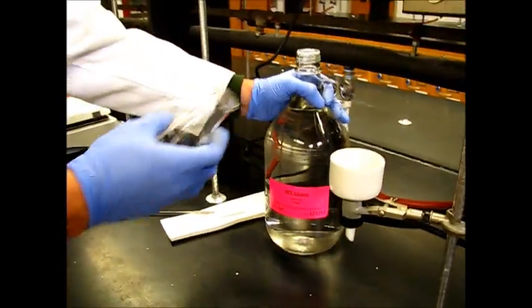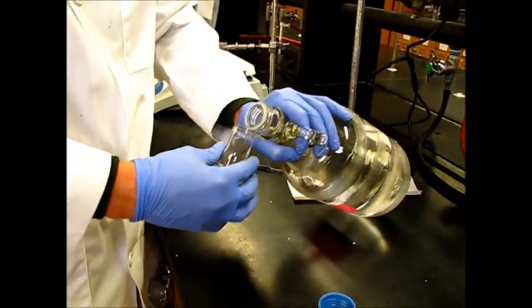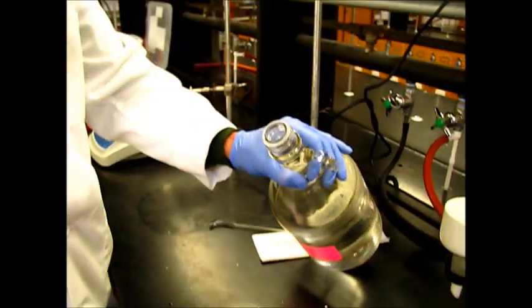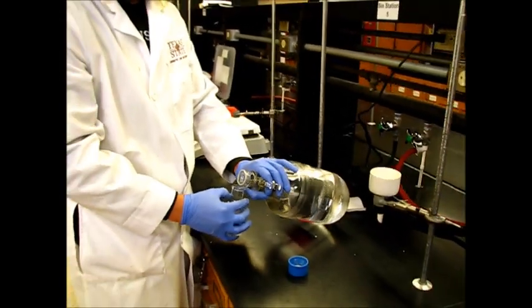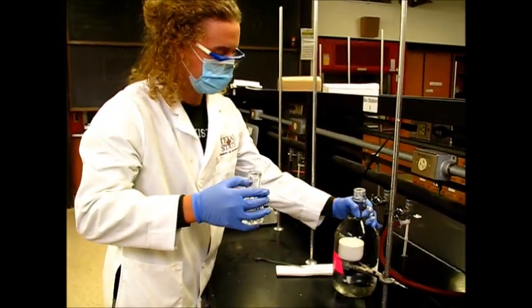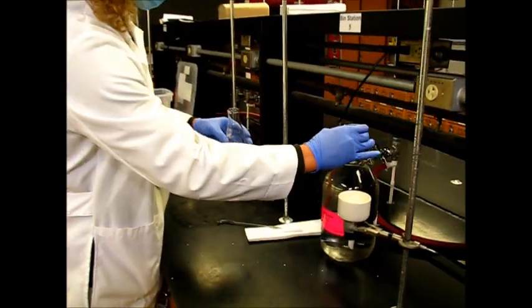We're going to start this recrystallization by adding about 20 or 30 milliliters of ethanol to this Erlenmeyer flask — maybe a little bit more. You want to add enough to where it will dissolve, but you don't want to add too much, because then whenever we do the distillation, it'll take longer to remove the greater volume of liquid.